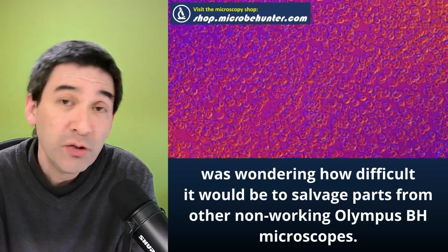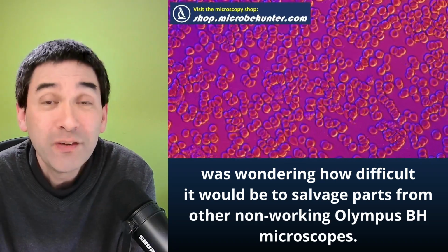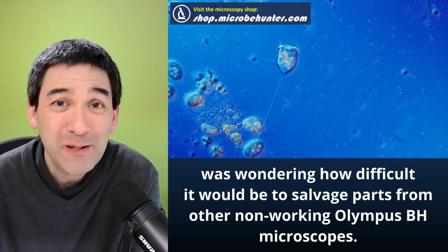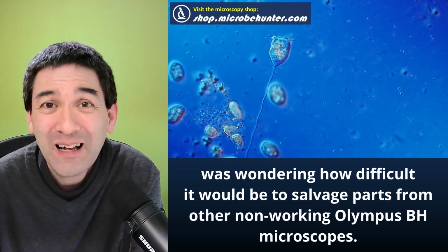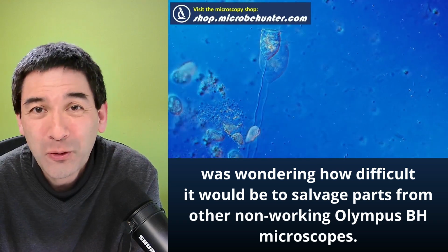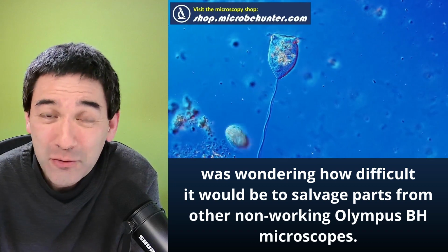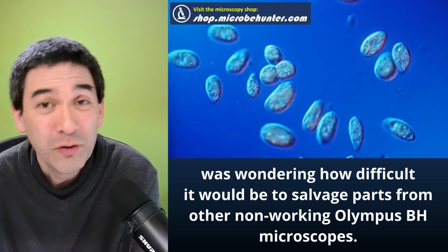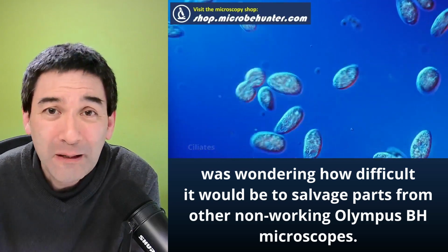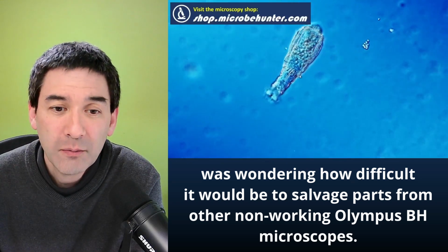So I would say you can justify refurbishing old microscopes, specifically if you have a specific interest in doing so. But you have to be aware that it might take some time to obtain all of the parts. It's really a question of where you want to place the focus. Do you want to place the focus more on the hardware part, on microscope maintenance and refurbishing, which is certainly very interesting, or is your focus mostly on observing nature, making videos and pictures and so on? It really depends. Different people interpret the hobby differently, or a combination of both. And this is essentially something that is possible.